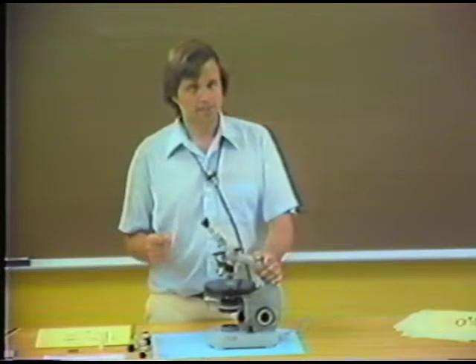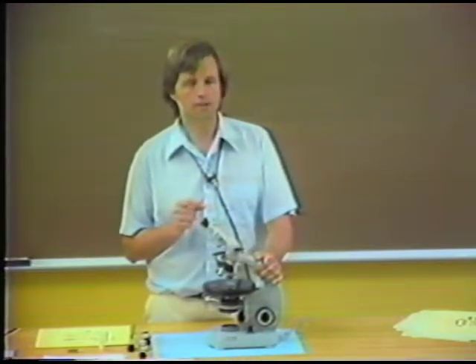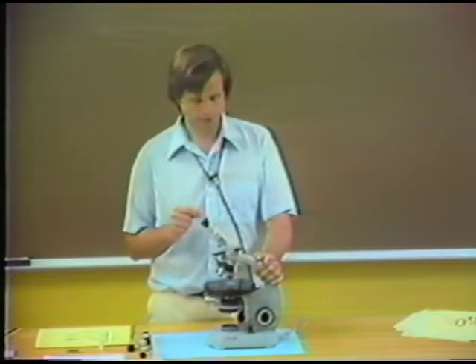And so if we have an unknown isotropic mineral, we can make continued tests in immersion, applying the oblique illumination test in the final stages, the central illumination test especially in the early stages when we're farther from a match, in order to estimate what the refractive index of that material is. When we find an oil that precisely matches, we should test the refractive index of that oil with the Abbe refractometer, as I've demonstrated before.